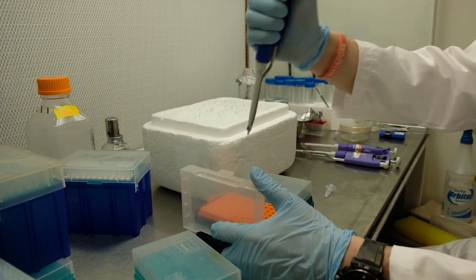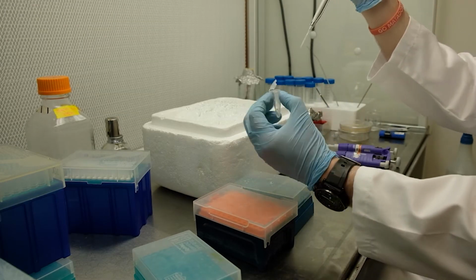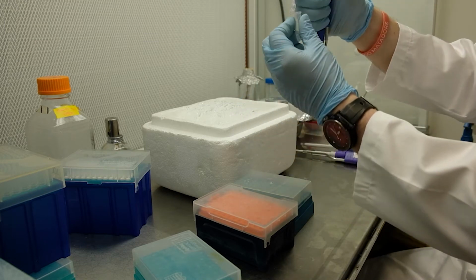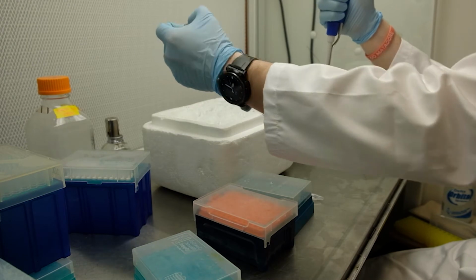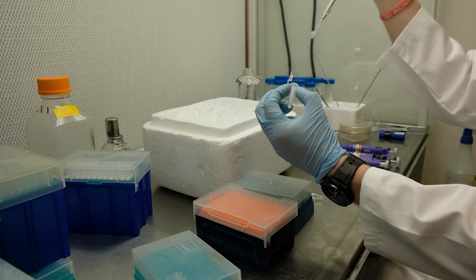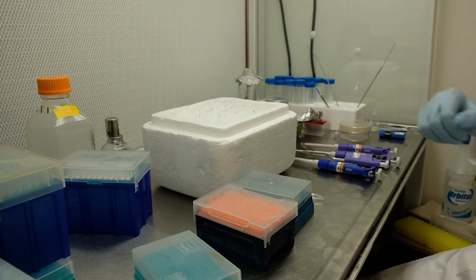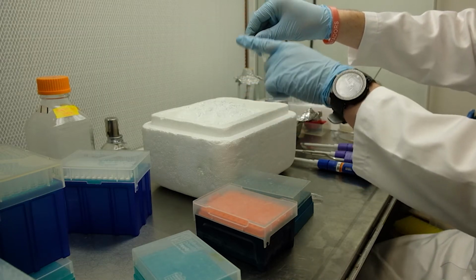And do the same for the other sample. Gently flick your cultures with DNA before letting them incubate on ice.